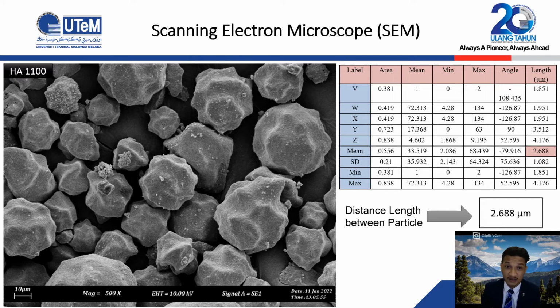The microstructure of calcined HA is highly agglomerated nanoparticles at 900 degrees Celsius for 2 hours. A few small HA rods grew over the surface of the powder, and with an increase in heat treatment temperature to 1100 degrees Celsius, HA rods grew across nearly the entire surface of the powders. The void and porosity of the particles decreased as the heat treatment temperature increased. The morphologies were in agreement with the study done by Wu and others.